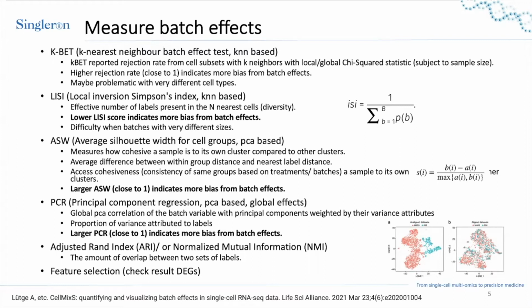One of the important perspectives for checking the corrected data is still to look at the UMAP itself, and the clusters or differentially expressed gene results, to check, for example, how correct the batch effect correction is and whether you are overcorrecting some of the counts.